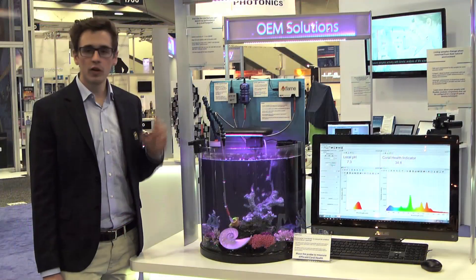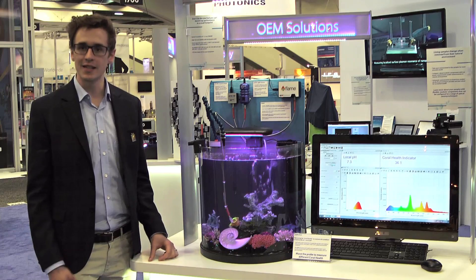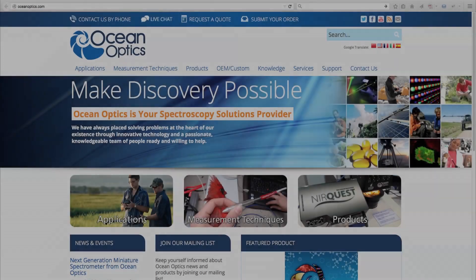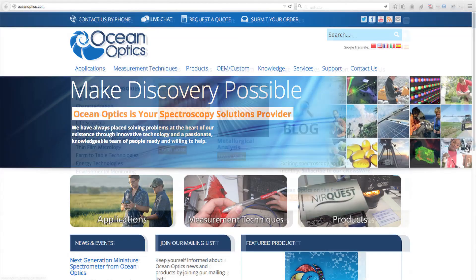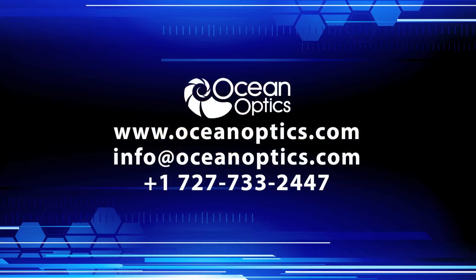This is just a couple of simple examples of how OceanOptics modular products make it easy to take spectroscopy out of the lab and into the field. For information on pH sensing, environmental monitoring, and many other spectroscopy-based applications, visit OceanOptics.com.